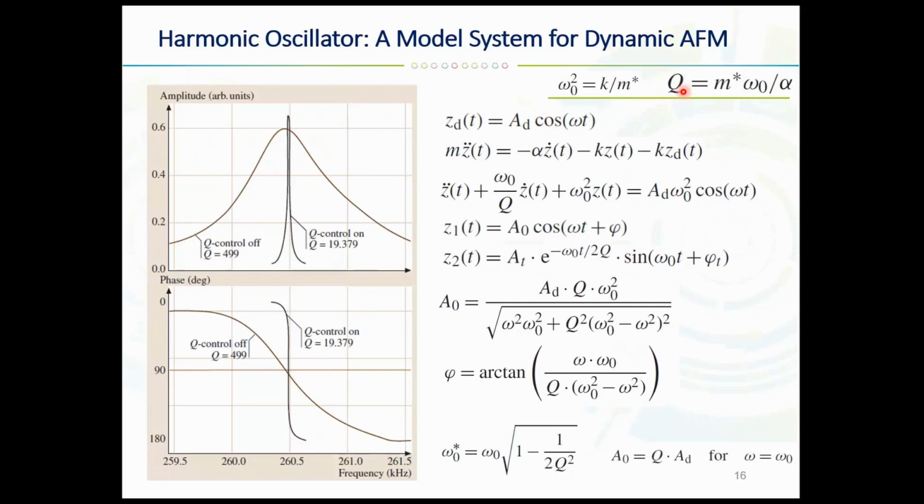So what is this quality factor? Quality factor mainly represents the internal dissipation in the vacuum of the cantilever during these oscillations. For example, when we have low damping, while we're using high quality cantilevers, we will have the change of this Q factor.